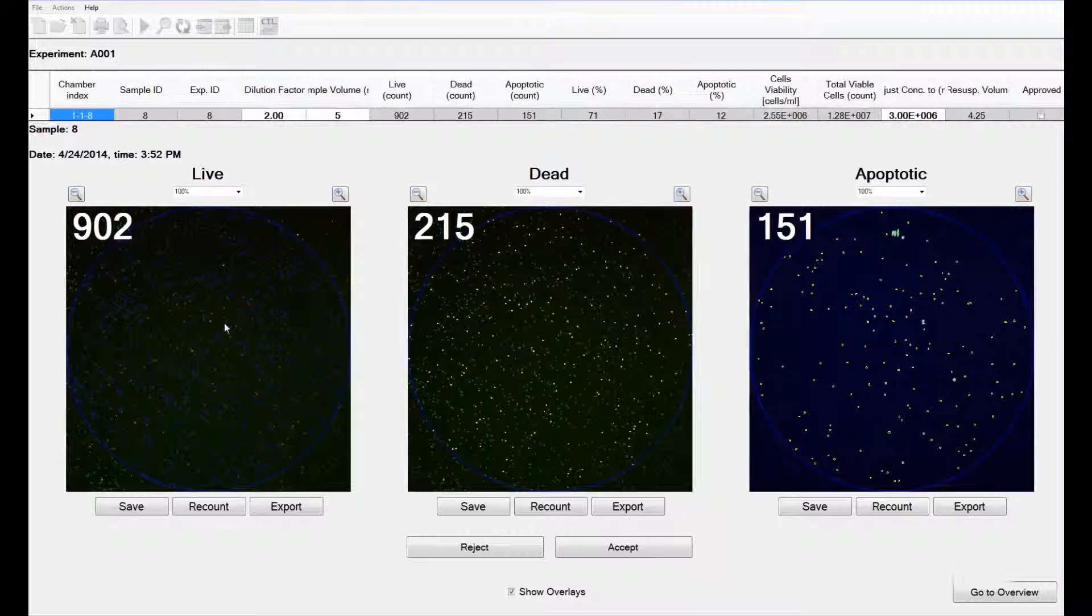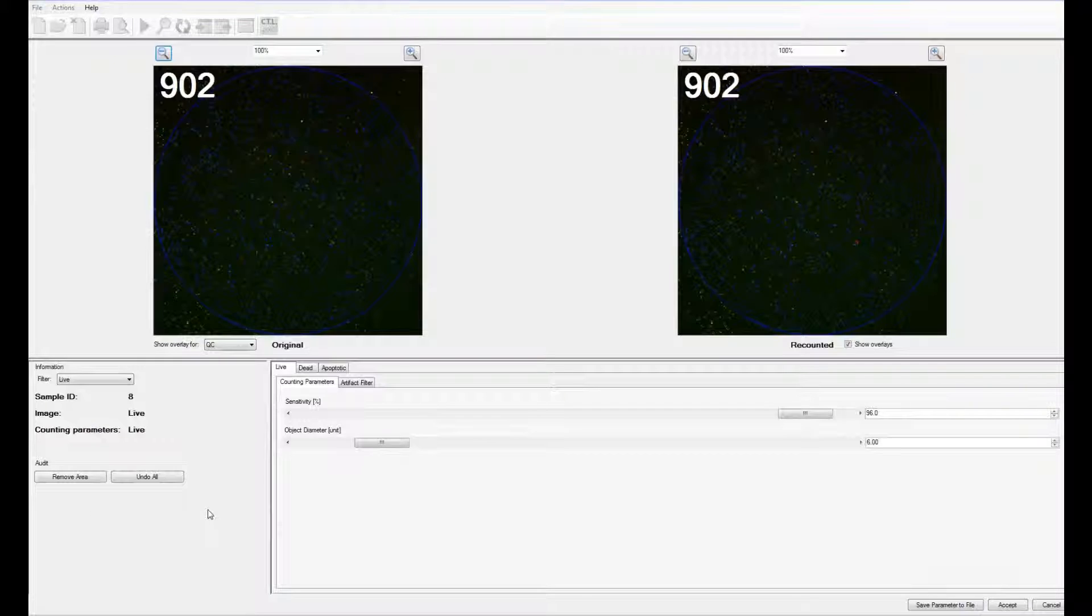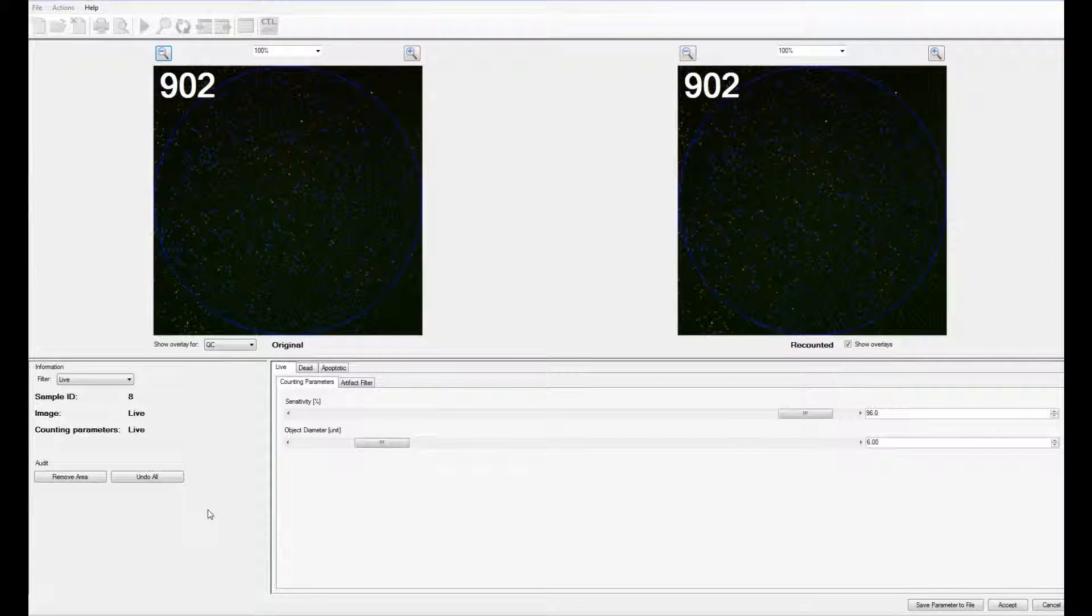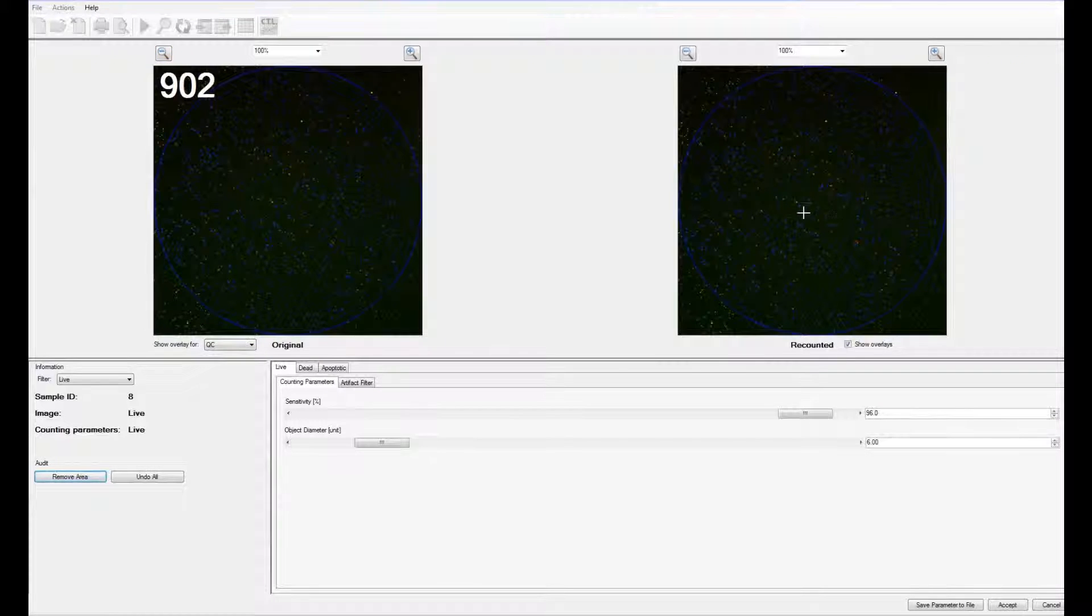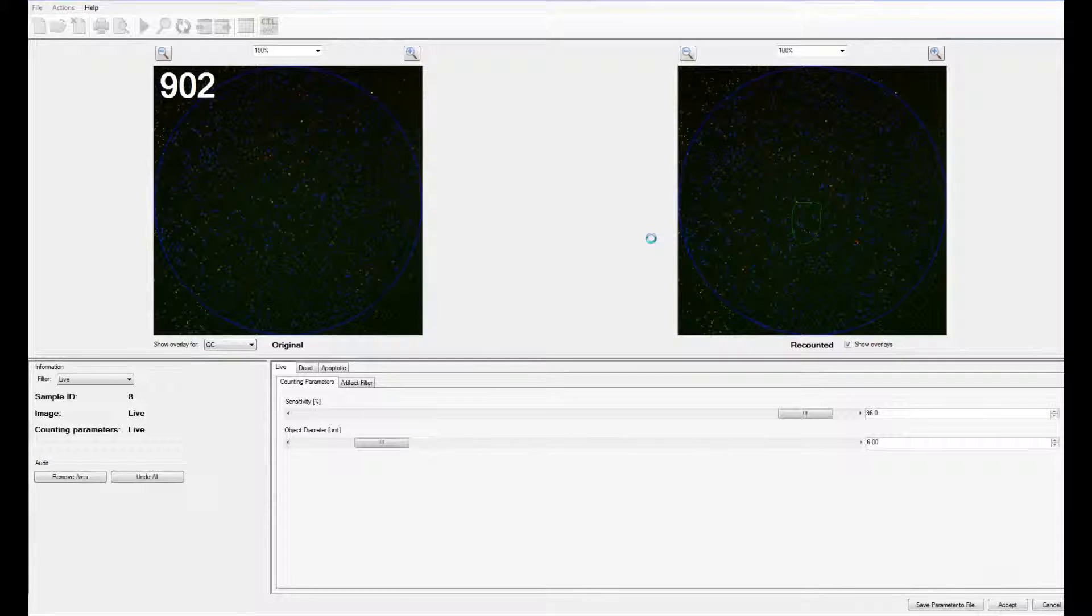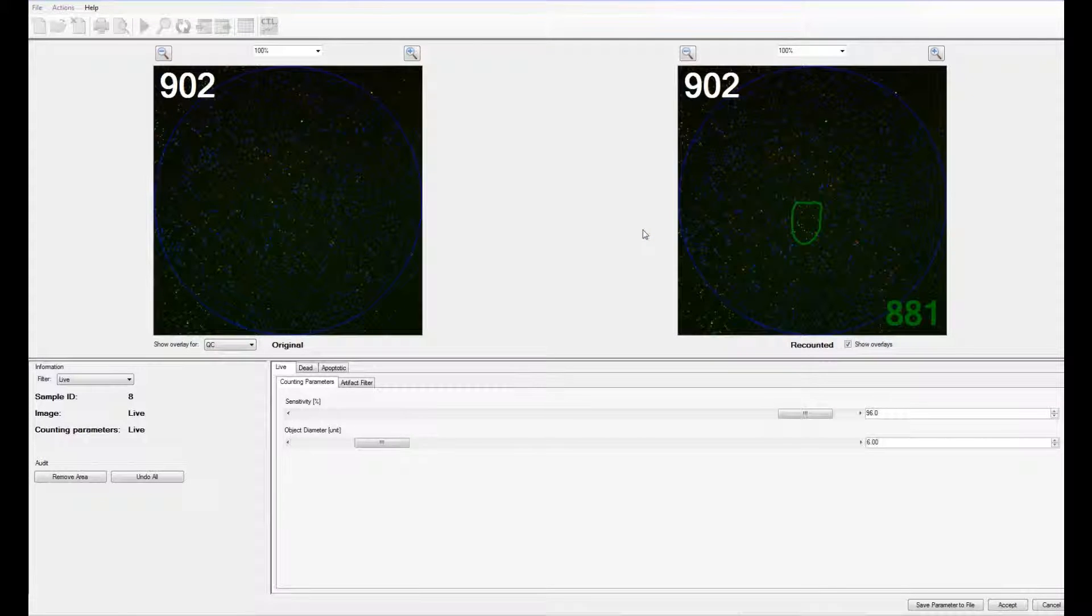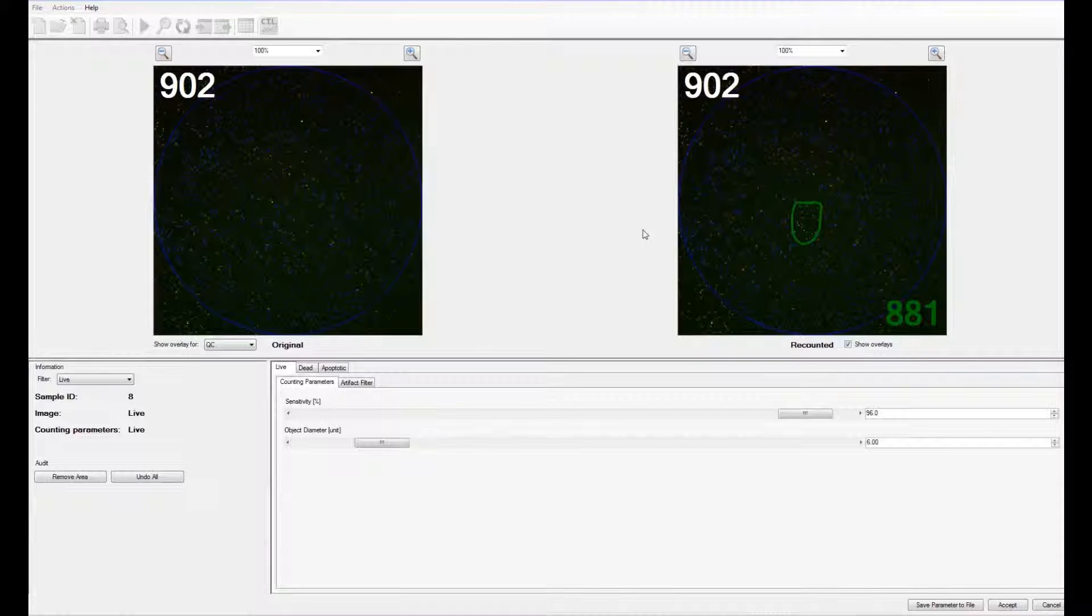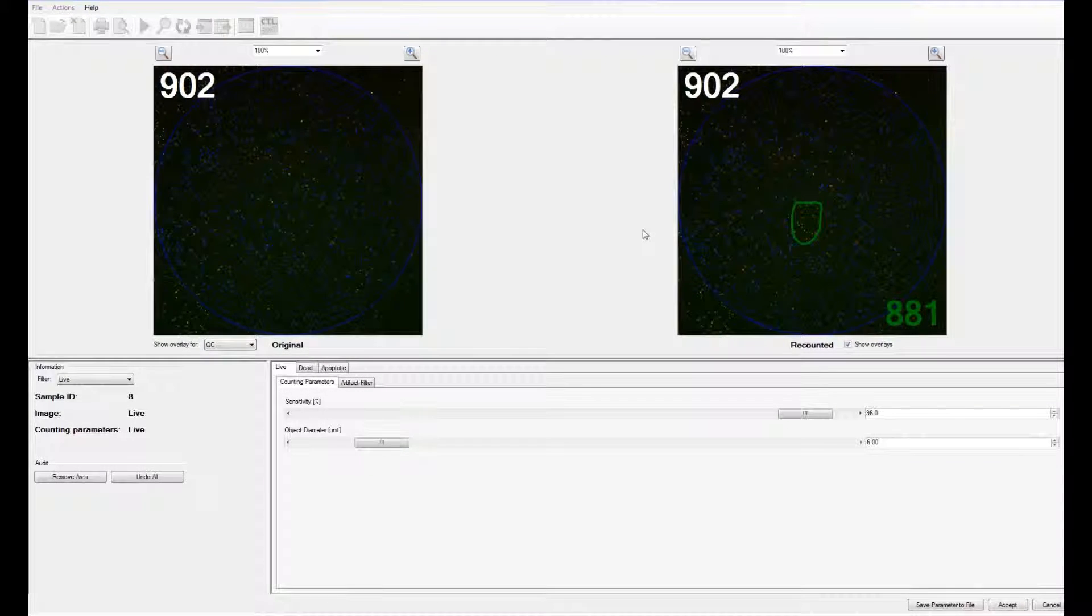To remove a portion of a chamber, say to exclude a fiber or a bubble, you can use the Remove Area icon. Circle around the object that you want removed. The software will recount the cells in that chamber by removing the number from that area, averaging the number from the remaining area, and then normalizing it to the total area again.